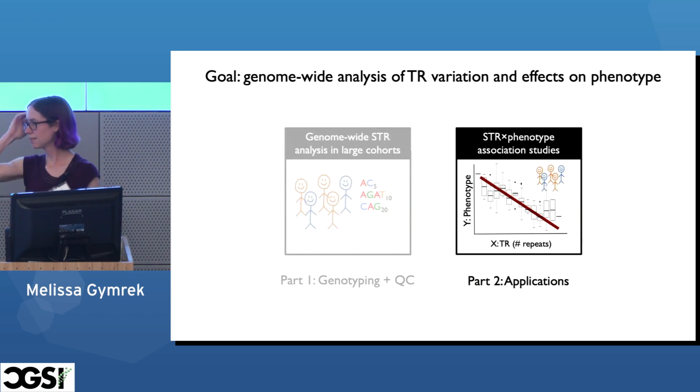To which extent, if any, does the fact that most of the sequencing is done using short reads limit the length of the repeats that can be recognized? Yes, that's a great question. The tool that I talked about, HipSTR, is really limited to things where the sequencing read can span across the repeat. It depends on the length of the read, but ballpark range, if the repeat is like 60 base pairs or more, we don't do a good job. The vast majority of the repeats in the genome are actually shorter than that, and so we can get the majority of those.